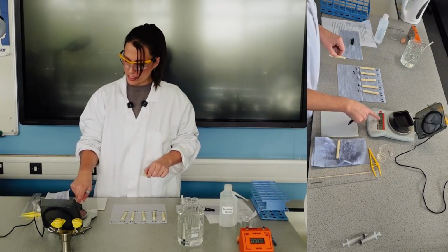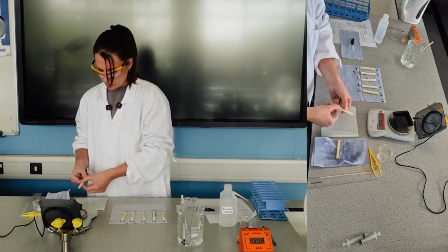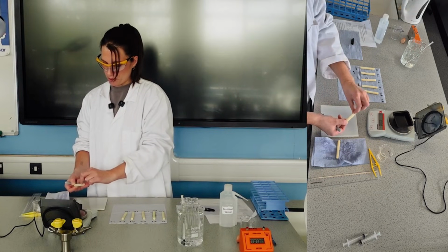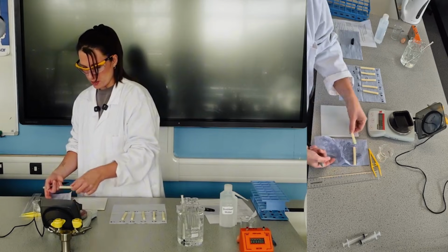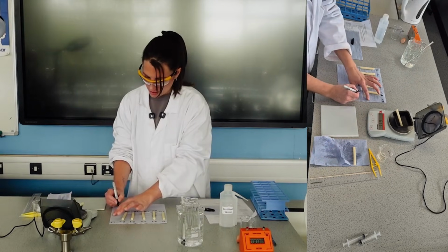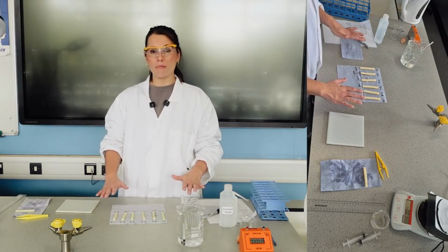And if you do ever get where it's deviating from 0 when it's empty, just press the 0 button again. In fact, I'm not going to use this one because I can see that there's a bit of a hollow part there. So that means we don't actually have the same surface area as the others. So I'm going to go for this one instead. That's 611. So we've measured all of those start masses.